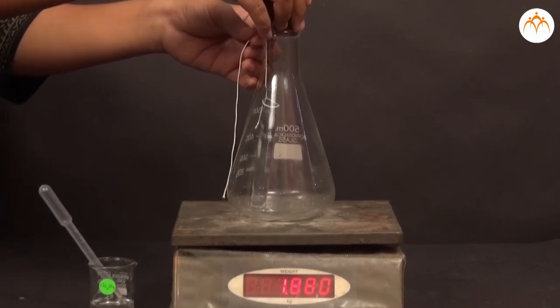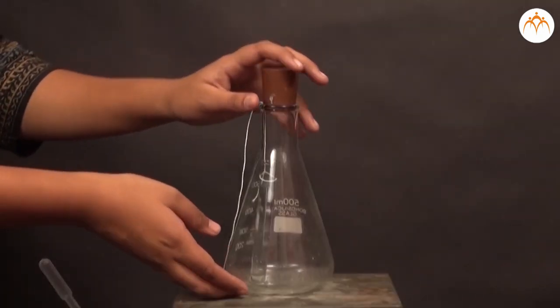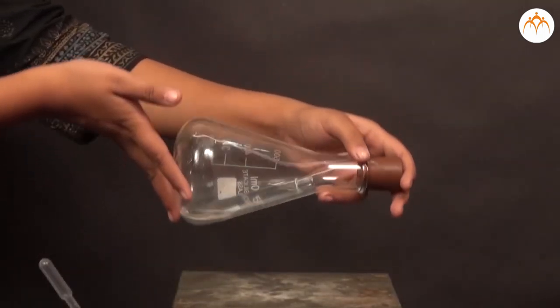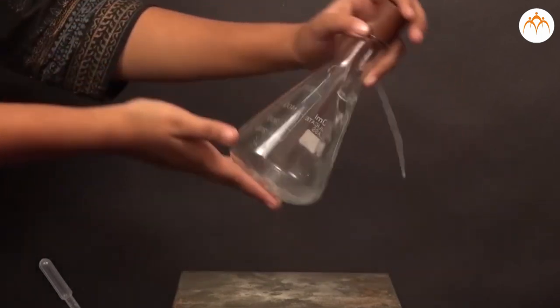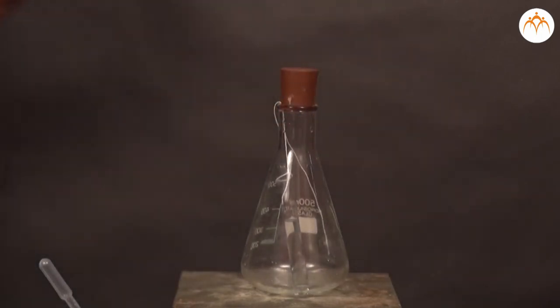We weigh this assembly together on a balance. We tilt the flask and mix the solutions in the conical flask and test tube. Now we weigh the assembly again.